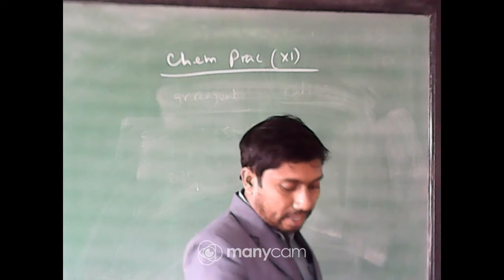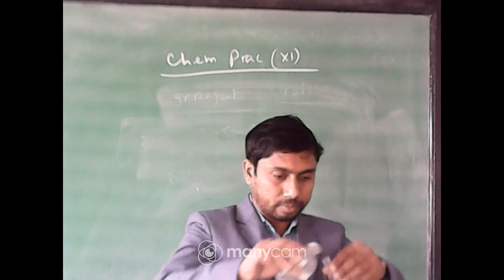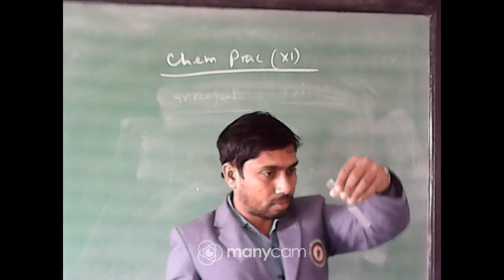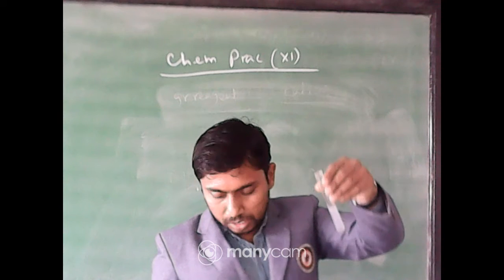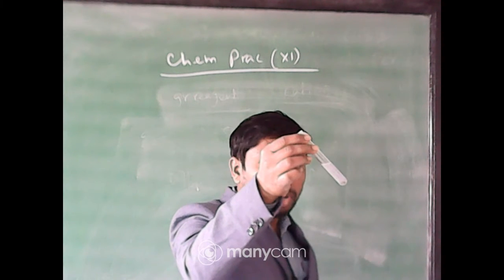Next, we will add NH4OH, this is ammonium hydroxide solution. Okay, a very light white PPT came after the addition of NH4OH.